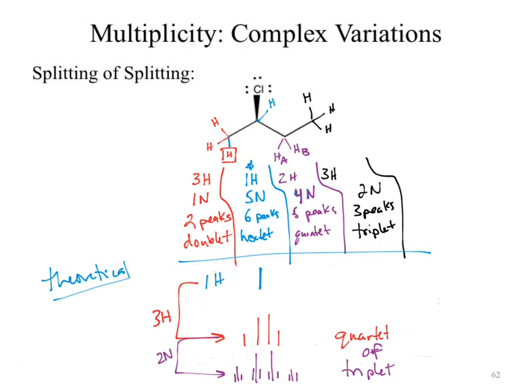Question. How do you know which one to go to? So why didn't you split that one signal into 3 signals? Why did I not split it as a triplet of quartets? Good question. How would you know? Experiment. That's it. You'd have to go to the experiment to see. It's going to be based off of whichever splits more strongly than the other. That is you're going to see in your spectrum. I don't expect you to be able to predict that. Madeline, does that get you your quartet of triplets? Okay. Or technically our triplet of quartets.